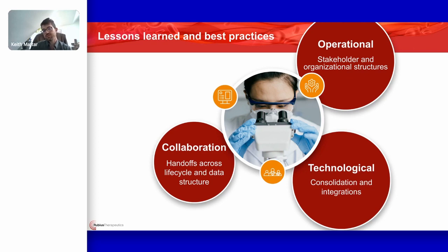And then lastly, you want to make sure that Benchling is directly accessible at the bench from within the lab. You don't want users to have to jot down notes on sticky notes and then bring all of that back to their desk and enter the data. So it's better to have either laptops or some sort of way to enter the data directly in the lab.